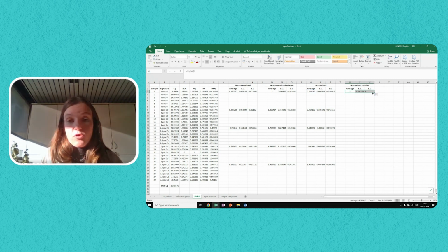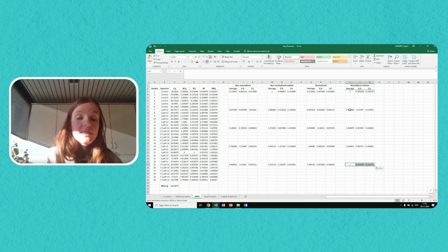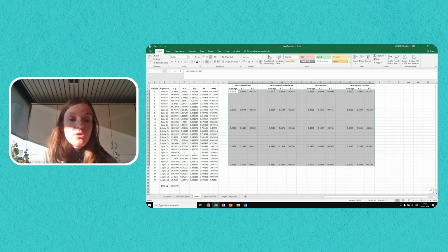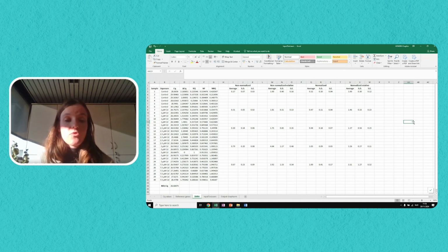And then we drag the formula to the right and paste it in the correct lines again. Then, to make things a little bit more visually appealing, you can also reduce the number of decimals in the Excel sheet. It always looks neater and is also easier to interpret.